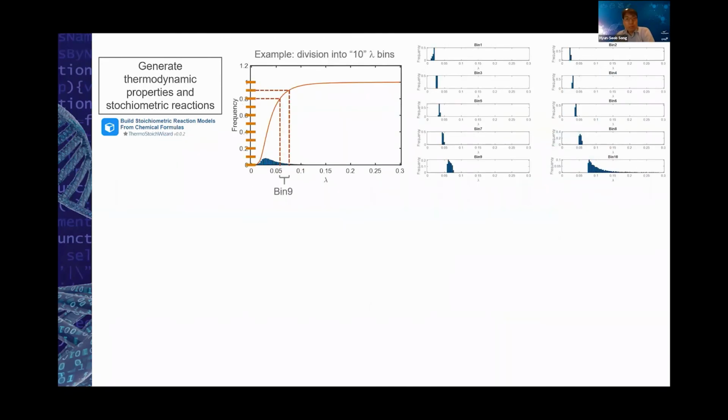This app also generates defined lambda bins. Why do I define lambda bins? Because eventually I want to use this output for dynamic simulation. For example, for the Altamaha surface water and pore water samples, we have more than 10,000 compounds that have chemical formulas. Simulating 10,000 is possible, but it takes longer, and sometimes we are not learning a lot by including all. So I think it's a good idea to start from a simplified set or subset of compounds, or we can just define representative compounds.